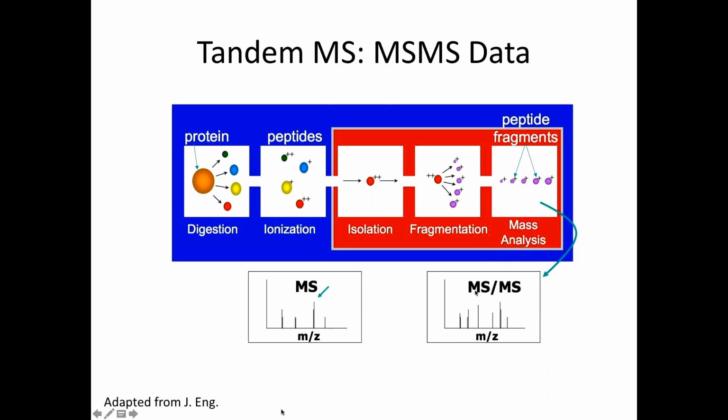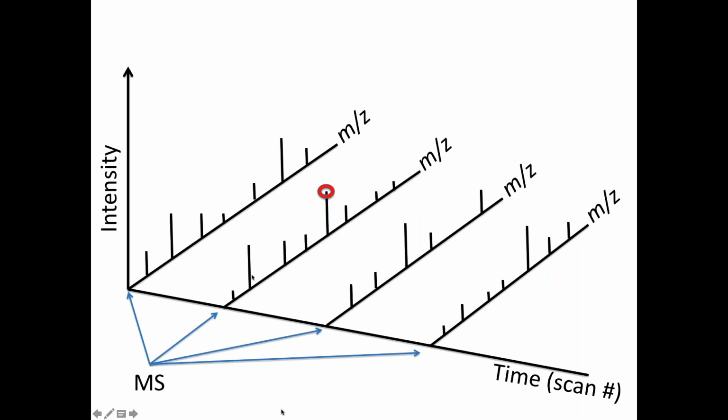But basically, what this looks like now is in your mass slice, your time slice, where that peptide's coming off from the HPLC, you're going to select that guy. You're going to collisionally activate it and record its fragmentation. Now, these Orbitrap instruments do this by selecting, in the older versions, top 5, second generation top 10. Now we're doing top 50 on the Lumos. So for every single run, it could do 50 MSMS experiments.